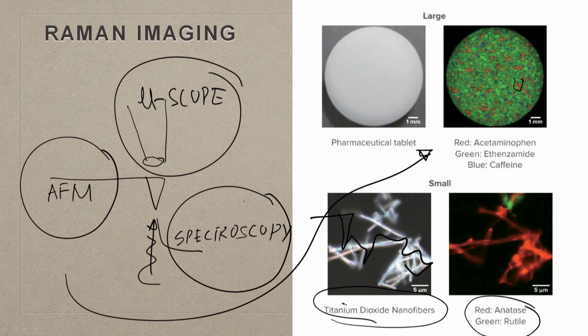And we have already talked about multimodal imaging by coupling AFM with microscopy and spectroscopic techniques, where you really can detect what kind of atoms are present on the surface, and you can rebuild the three-dimensional geometry of them.